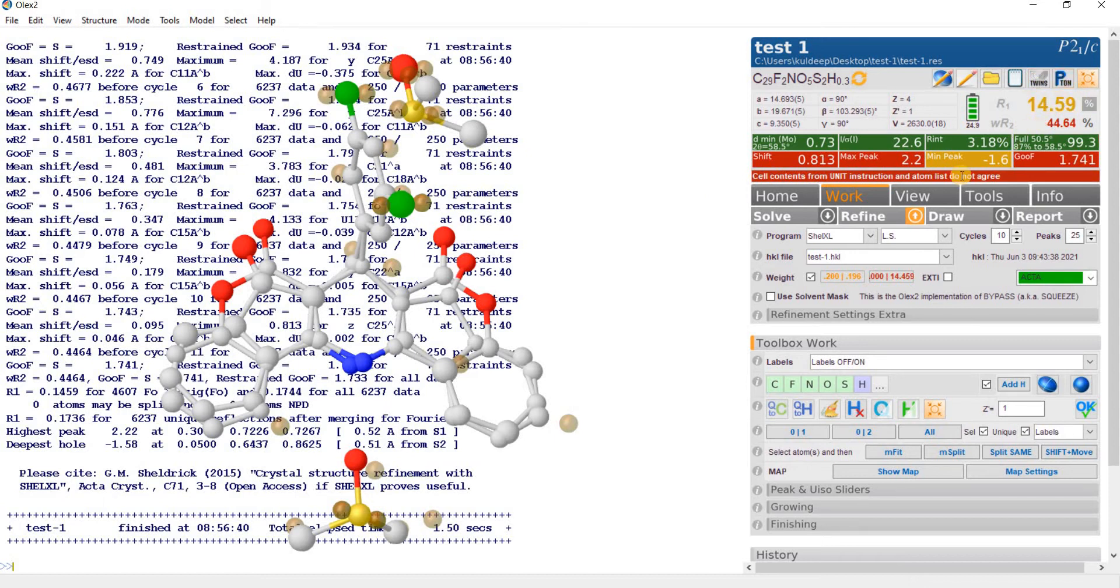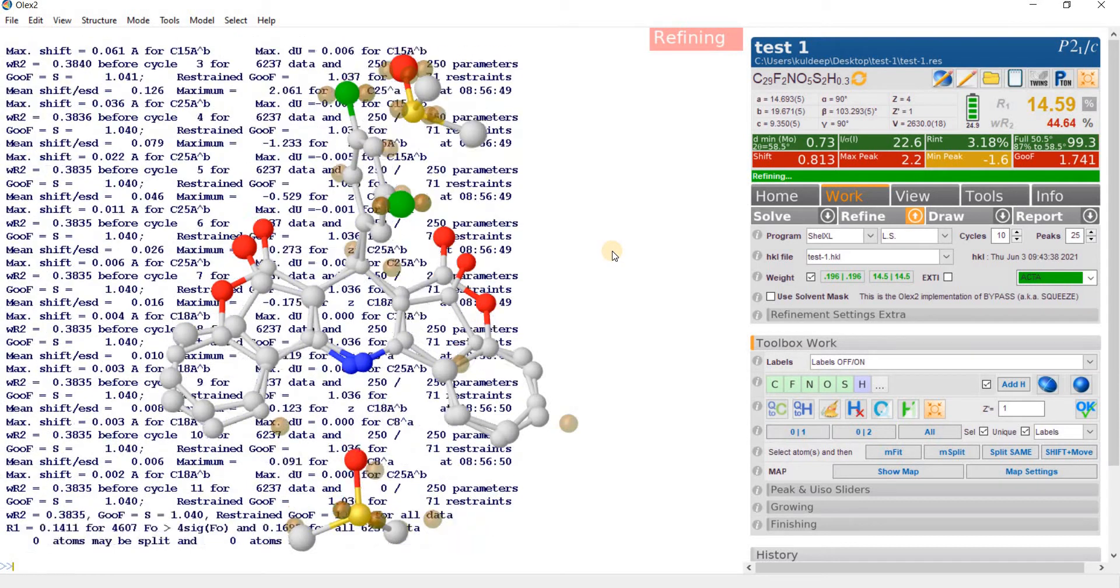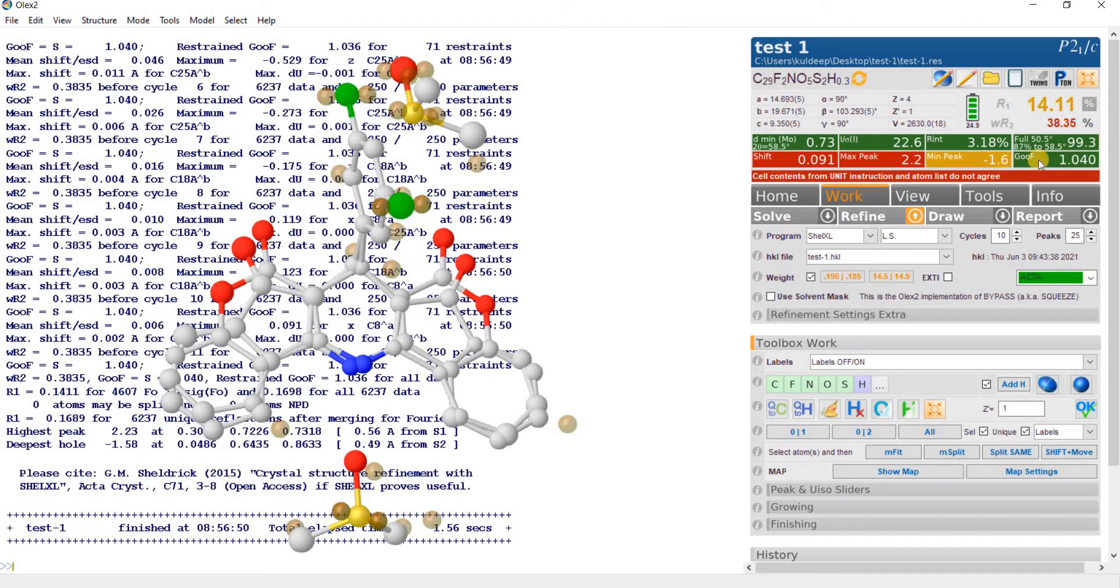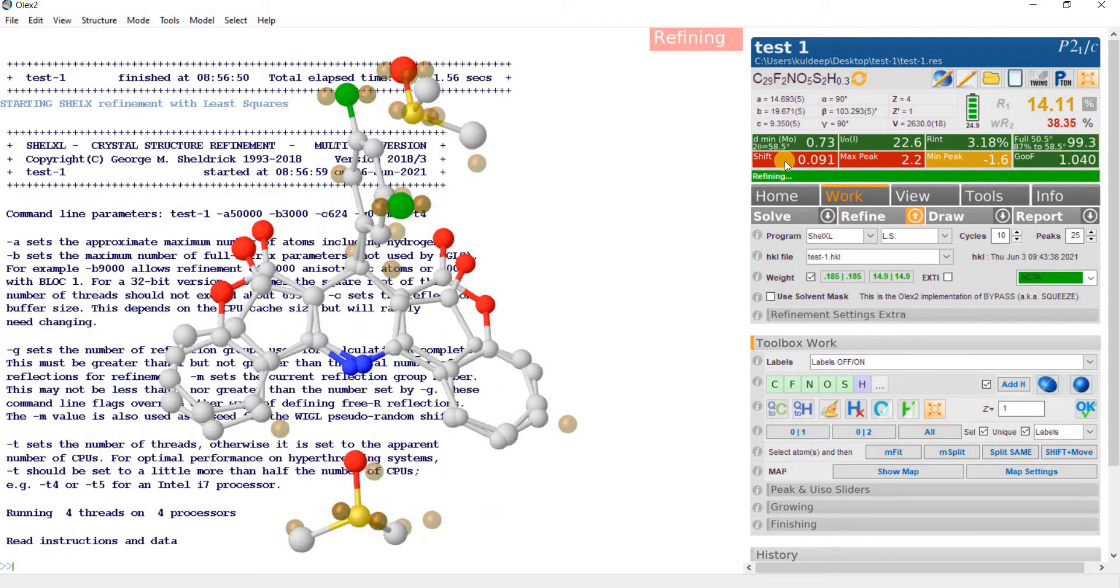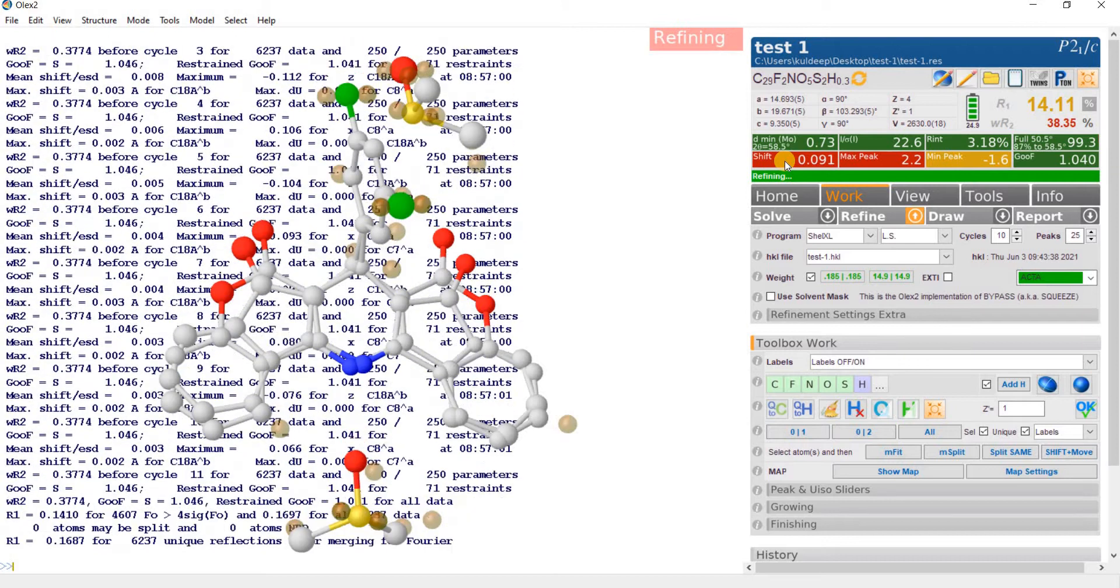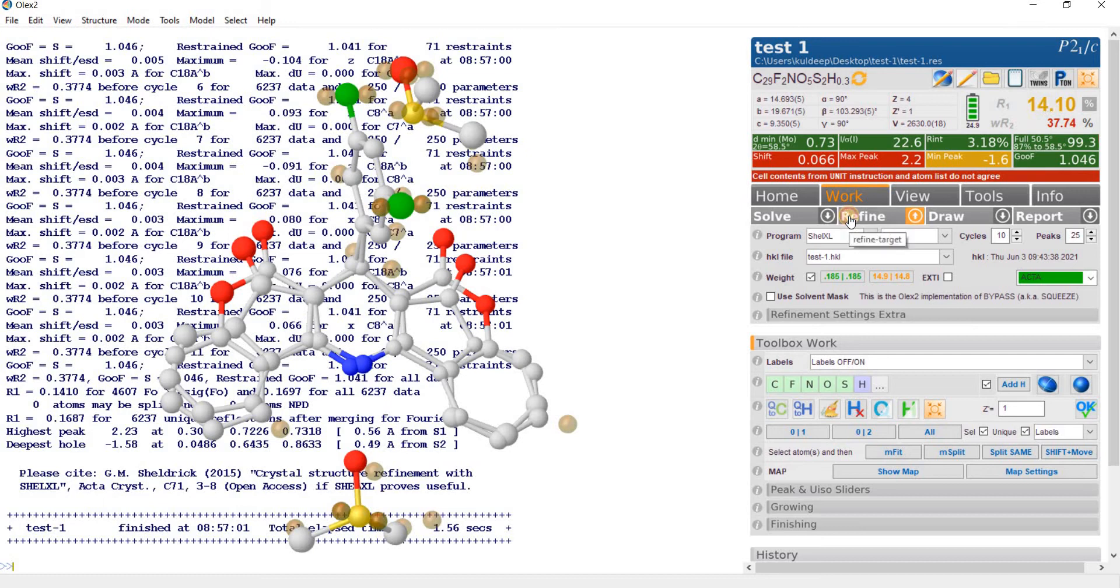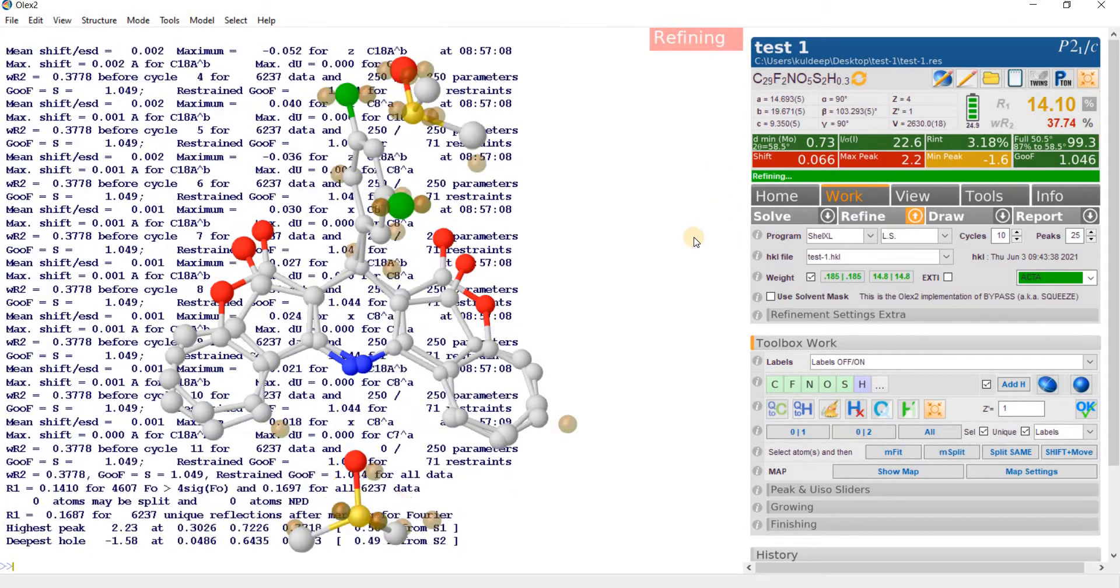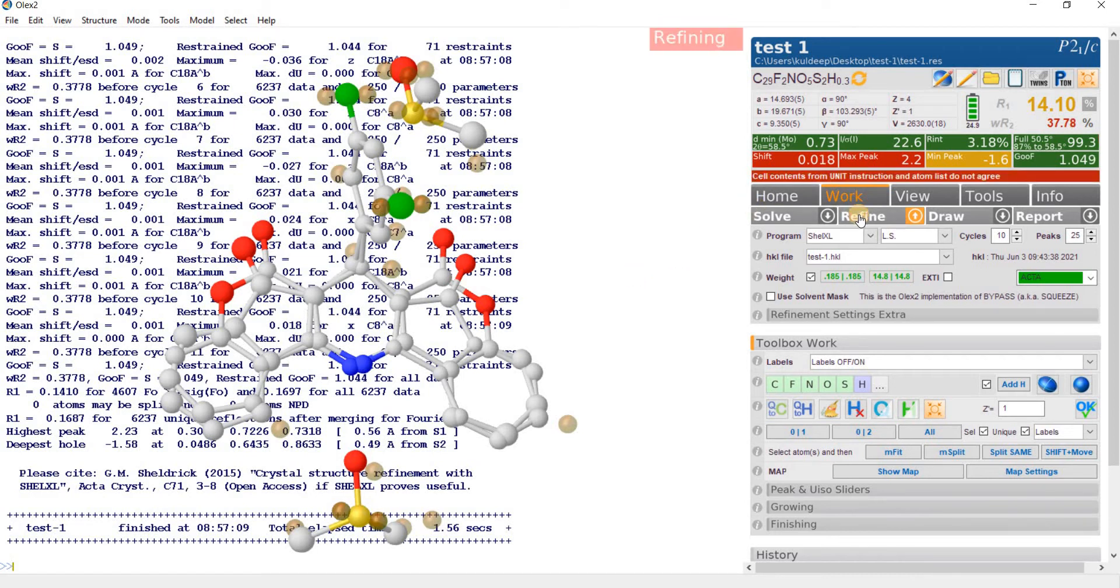The R factor is around 14%, refine one more time. Refine one more time. The shift gets stabilized. R factor is around 14%. Refine one more time. The shift gets stabilized. One more time.